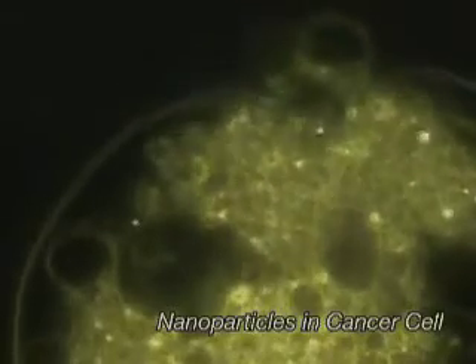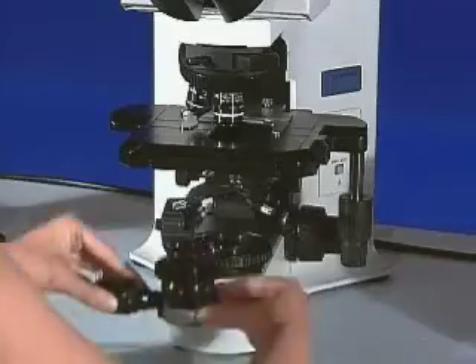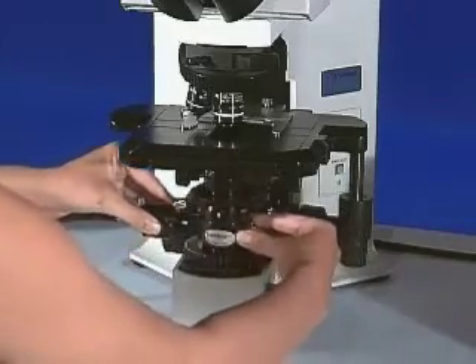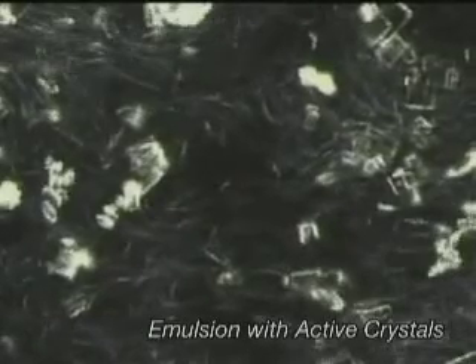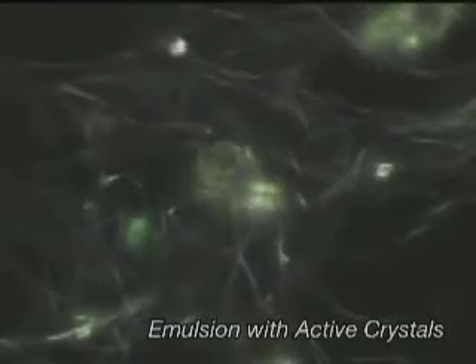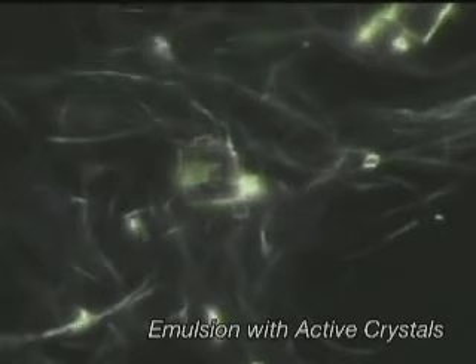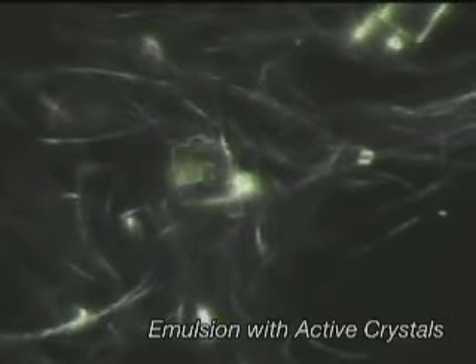By simply attaching the easy-to-use CytoViva system to existing microscopes, researchers can observe biological and nanomaterials, emulsions, nanoparticles, and composites individually and in combination with labels, highlighting important features and their intended application.